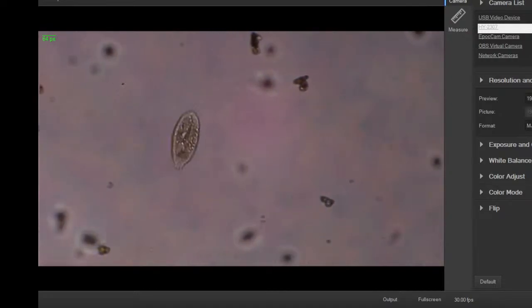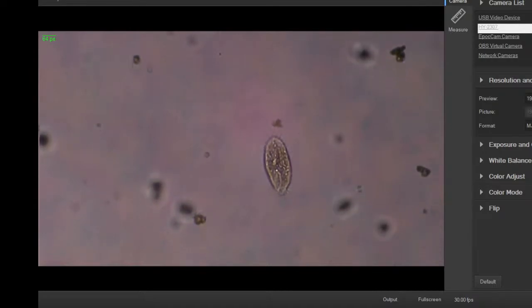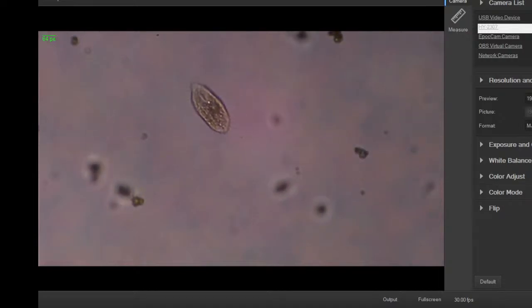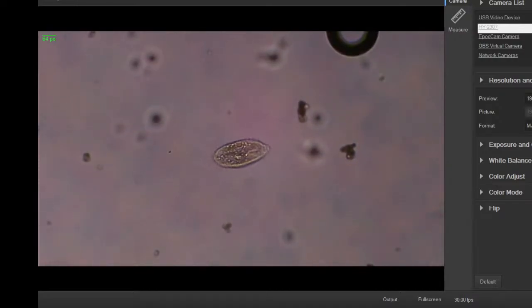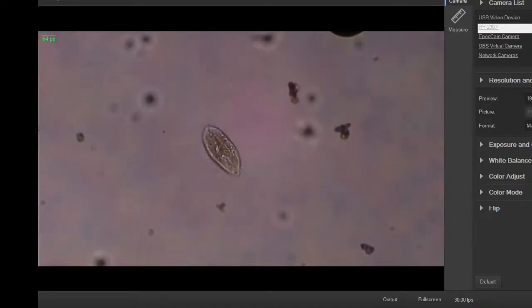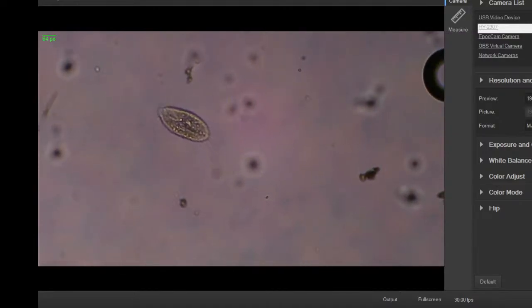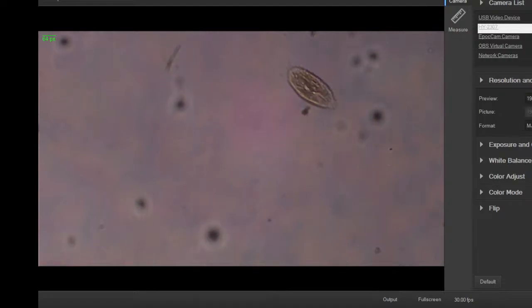So, anyway, this character's out looking for yum-yums. And luckily he's not moving very quick. He's very jerky, though. Some animals have this feeding behavior. And some of them do it as like a defensive mechanism. It's like either exposure to a chemical it doesn't like, or potential something it perceives as maybe a prey item nearby. In this case, definitely mistakenly, because there's nothing there to harass it. But it has its own little quirks, just like we all do.